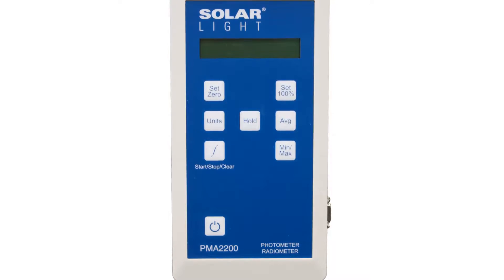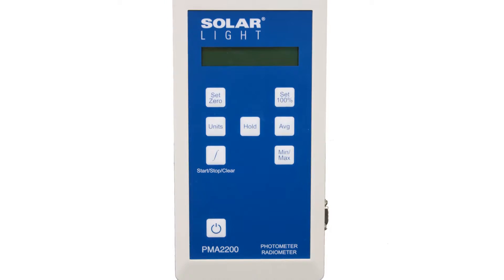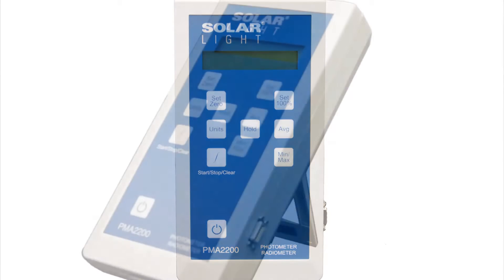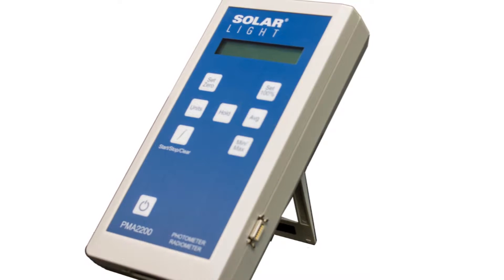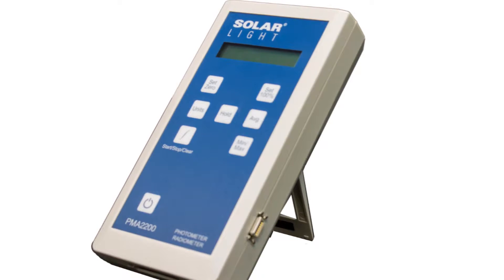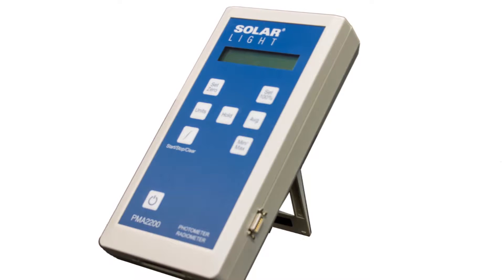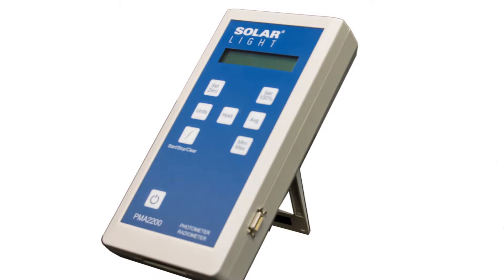Our patented intelligent detector technology allows users to interchange sensors without losing the functionality of a single-purpose meter, while the automatic sensor recognition feature eliminates the need to match meters and sensors. Any of our PMA sensors can interface with any PMA meter thanks to a memory chip, which makes it unnecessary to permanently load sensor information into the meter.